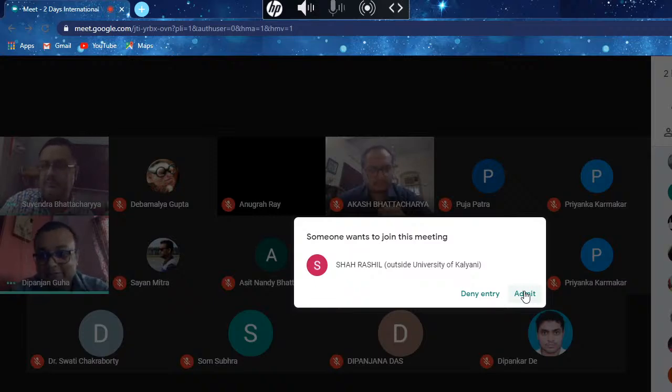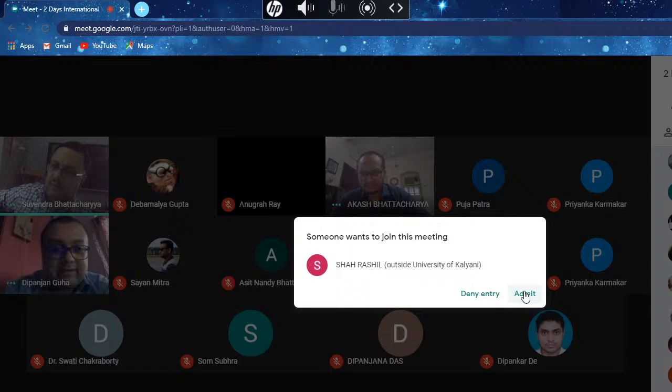Oh, thank you. So one person has posted something, I think. Nirajan Ghoshal is asking, I would like to know which kind of software is used to measure the co-localization or internalization between organelles. Is it associated with the microscope or available otherwise?